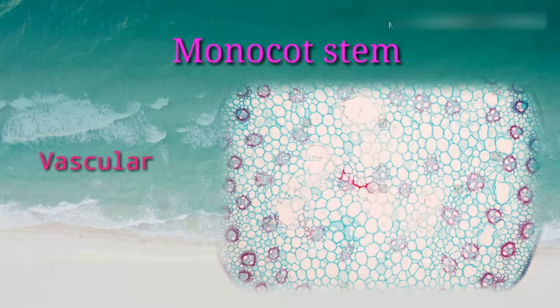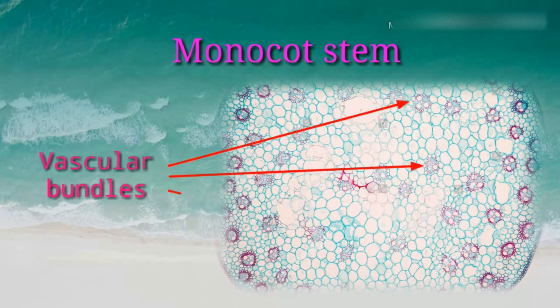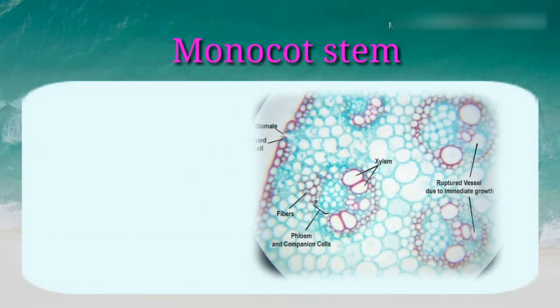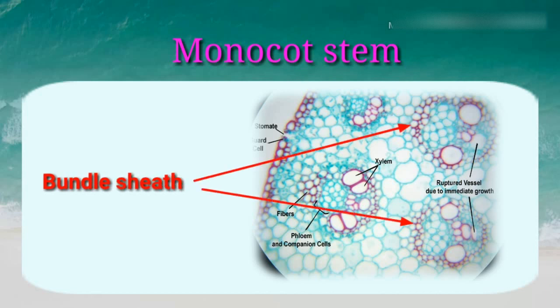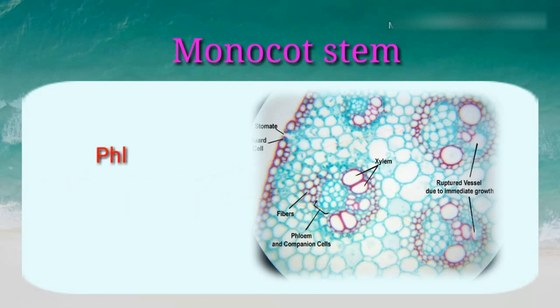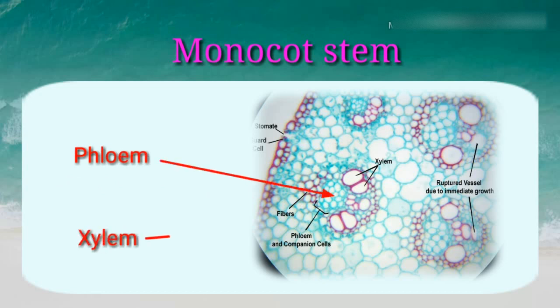Whenever you see the vascular bundles, you will observe that numerous vascular bundles are scattered throughout the ground tissue. These vascular bundles are oval in shape and surrounded by a sclerenchymatous sheath called bundle sheath. It contains both phloem and xylem — the phloem is present towards the periphery and xylem towards the center. Cambium is absent in them.